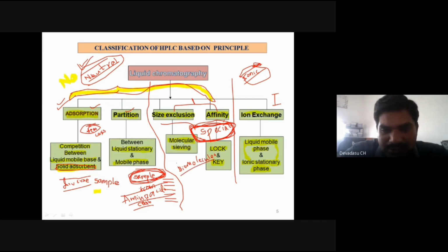Some of the molecules, though their origin is synthetic, are much bigger in their molecular size. Such types of samples may also be treated as a special kind of sample.